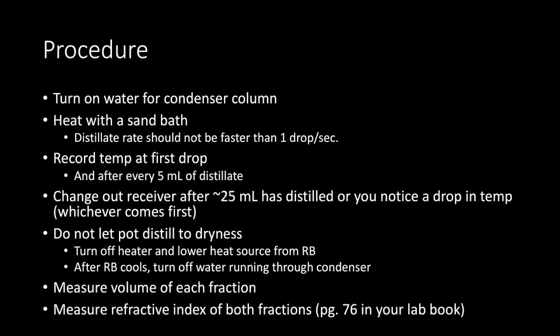You will want to observe and record the volume of each of your 2 fractions that you've collected and measure the refractive index of both fractions. For reference on refractive index measuring as it applies to distillations, your lab book, for whatever reason, didn't put this into the macro scale versions, but it did in one of the micro scale versions. So please read page 76 in your lab book if you have questions about the refractive index portion. I will also post a video on measuring refractive index.